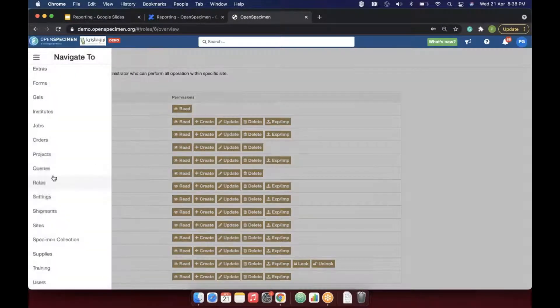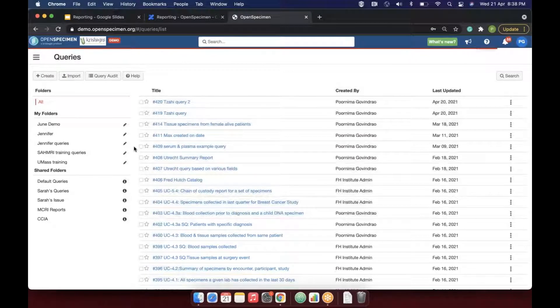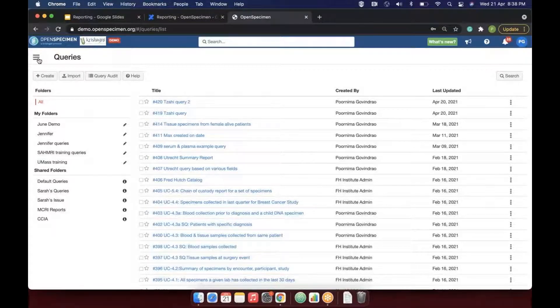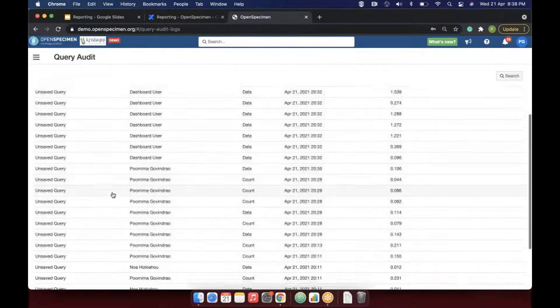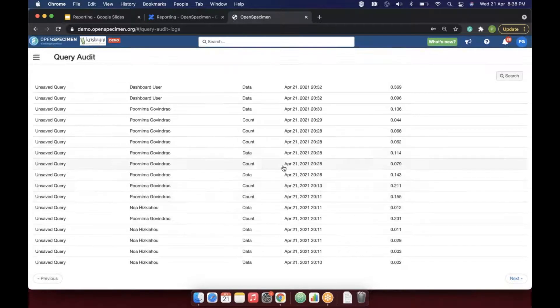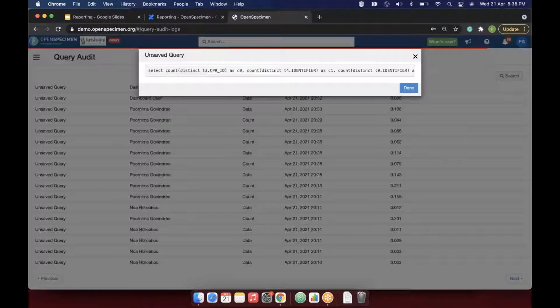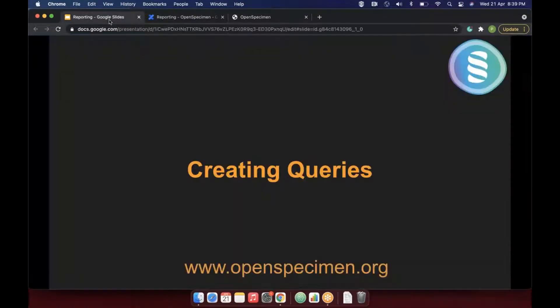Admins can look at the query audit in the system. When you log in and go to Queries, there is a query audit feature. Admins can use this to see which users are running what kinds of queries — whether it's a count-based query, a database query, or a saved query. Clicking on a particular query also shows the SQL of the query. Now let's dive into creation of actual reports and how to get the data out.